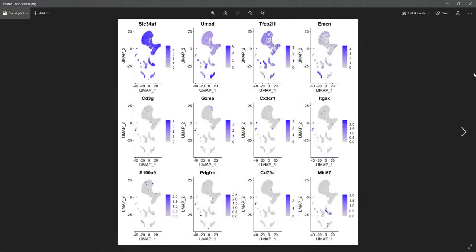like now. So this will be a typical feature plot, SLC34A1. So you can see it's quite ubiquitous, but it is proximal tubular really, whereas CX3CR1 may be macrophages, mesenchymal, PDGFR beta and so on, and not a whole lot of that there, but this is actually a sham kidney, it's uninjured, so not particularly shocking.